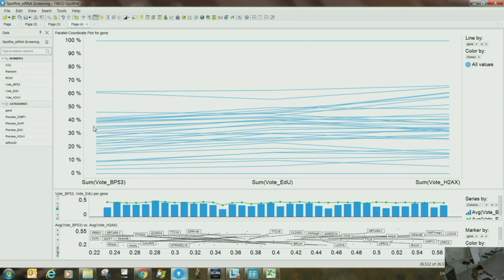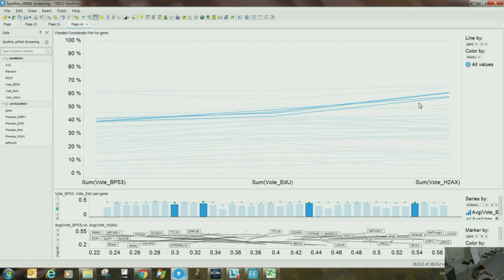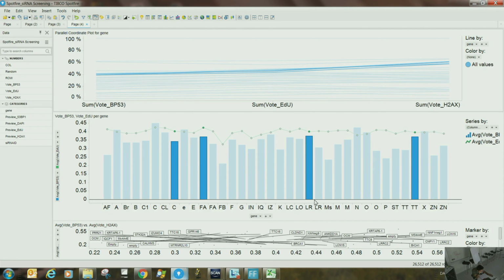And maybe actually I would say these guys you see here, they are different actually, because they are basically going in this profile and then going up and up. Maybe there is something interesting in that. So just select that and see what these genes are without even calculating this linear discriminant analysis and stuff like that, or principal component analysis. This is just very simple.